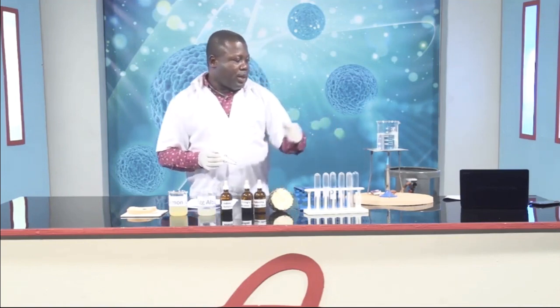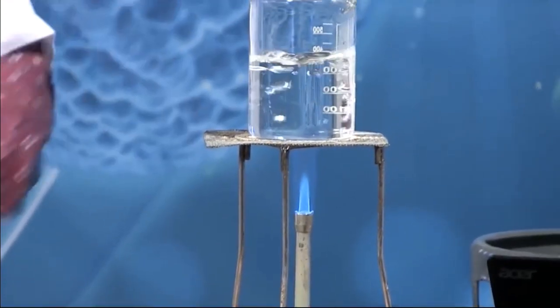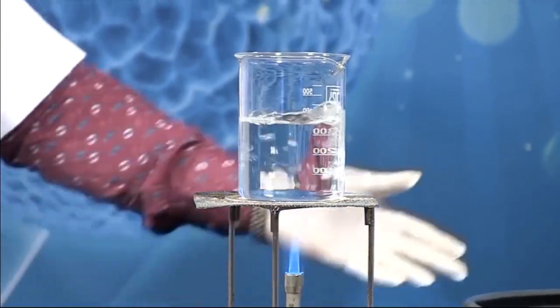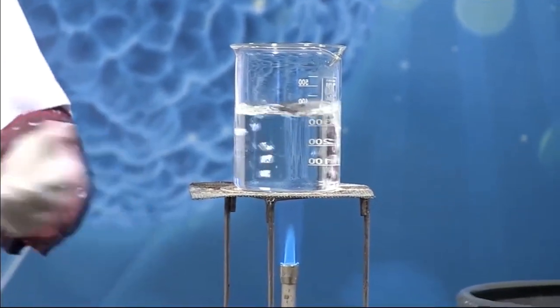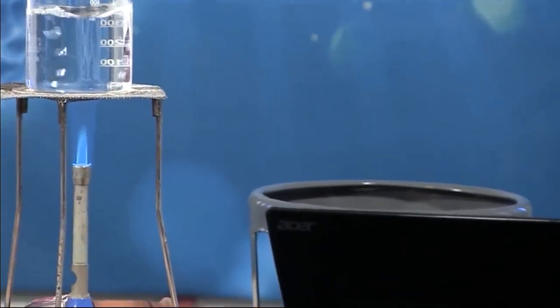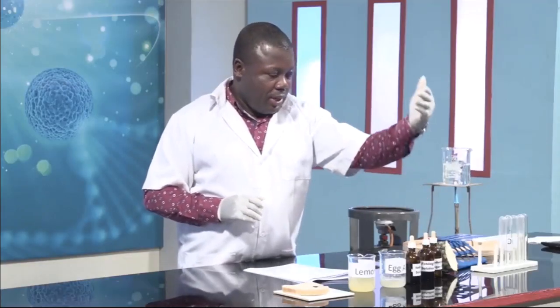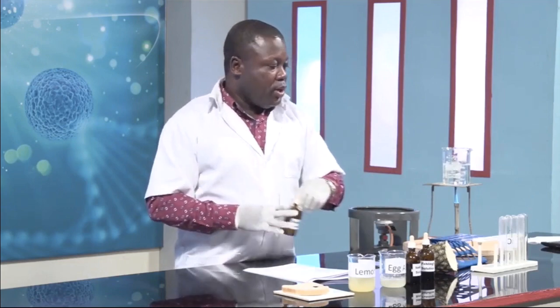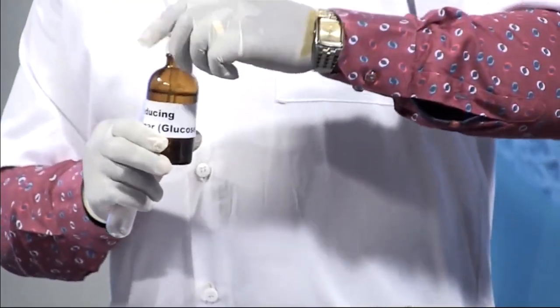Then we'll talk about our setup here. We have our boiling water, our stand, the gauze, and a cylinder containing gas as our source of heat. So we'll take our test tube and pour in, per the procedure, 2 cm cube of the reducing sugar.